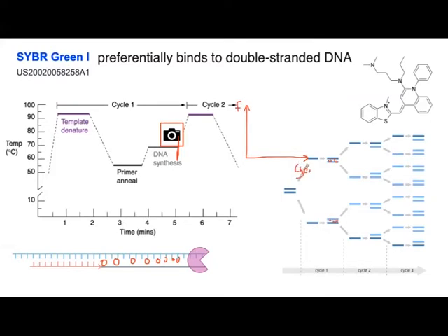After one cycle, I suppose the fluorescence of the tube will go up because now I'm getting 2 products that will have SYBR Green. Now, second cycle, I'm going to get 4 products if I'm starting with one molecule. So again, the fluorescence will keep going up. So after each cycle, the camera will measure the fluorescence because the SYBR Green only binds when you form a new double strand molecule. So that's why continuously you get increased fluorescence.